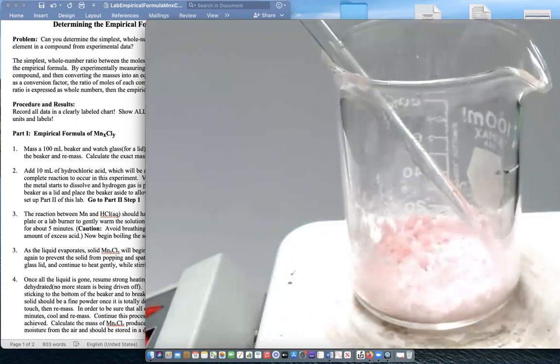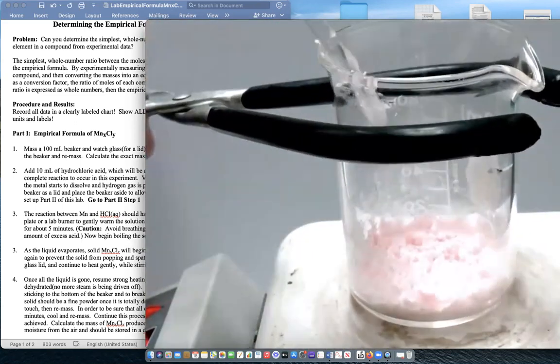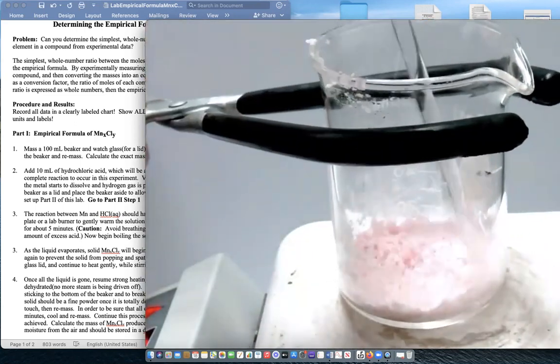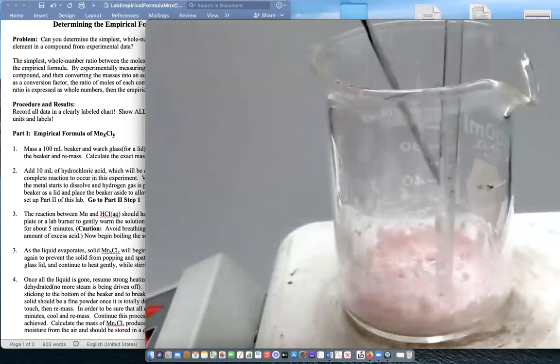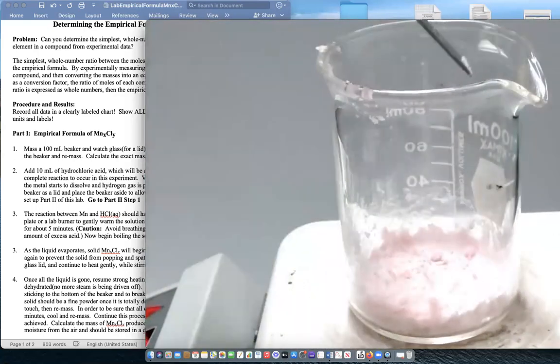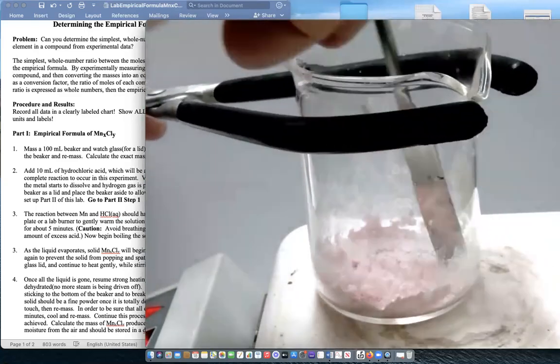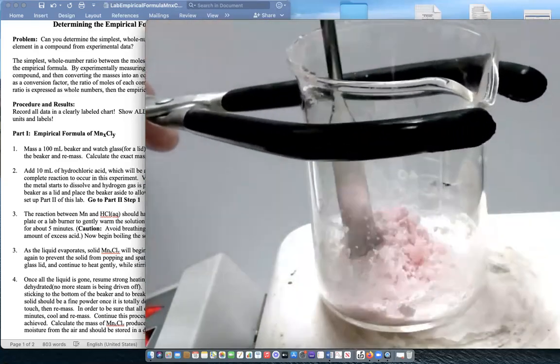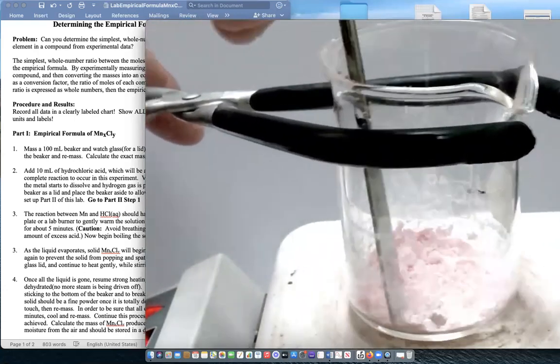But you'll get to a point that it will be totally dry. It's going to be a very light pink versus having a darker pink color. Sort of when you're doing the titration with phenolphthalein, you don't want a deep magenta, you just want a wisp of the pink color. And here I brought in my metal spatula and scraped off the little bit of excess that was on my stirring rod. So I'm taking that into account. I'm losing a little bit of product.